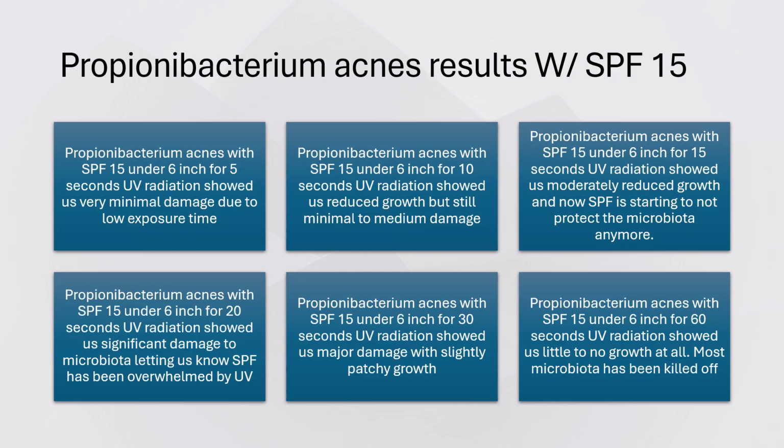And then once we bumped it on up to 15, this is where we started to see our reduction in bacterial growth. So SPF is starting to fade away, and it's not really protecting the microbiota anymore. And then once you get to 20 seconds, this is where you really see significant damage to microbiota, letting us know that the SPF's threshold has been overwhelmed by UV light.